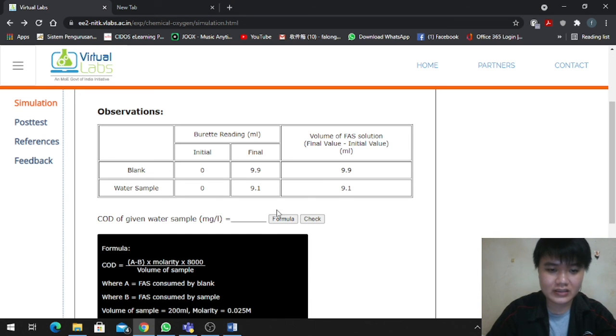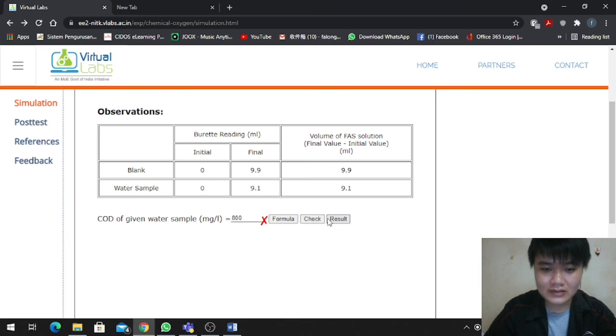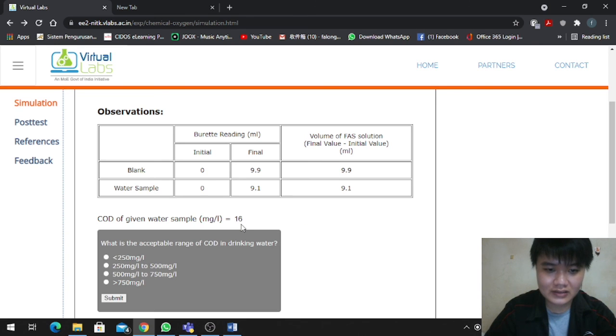We get 0.8 milligram per liter. So 16. The correct answer is 16.